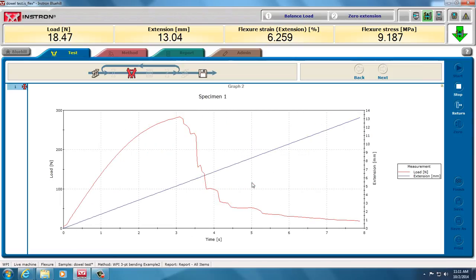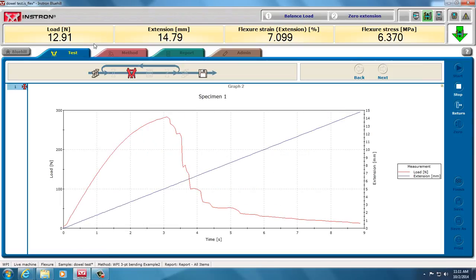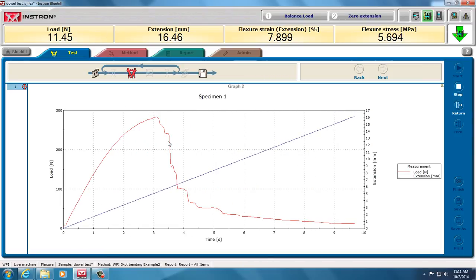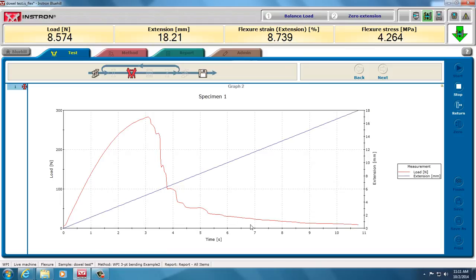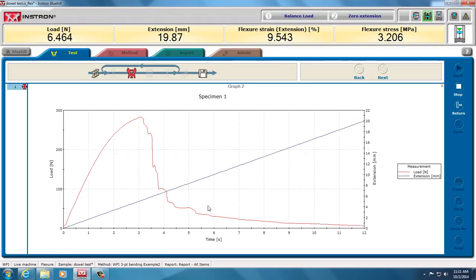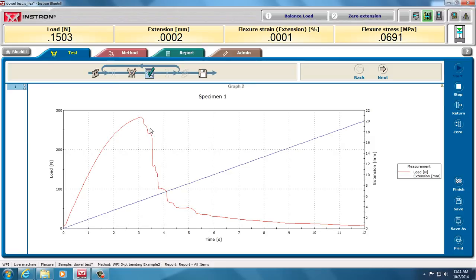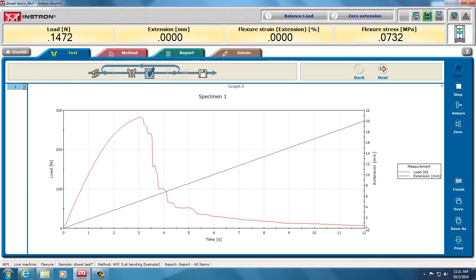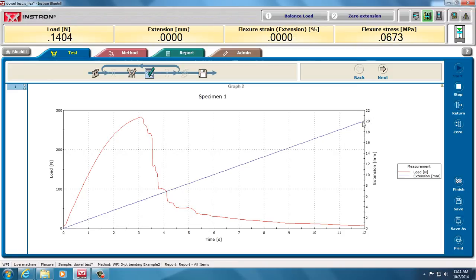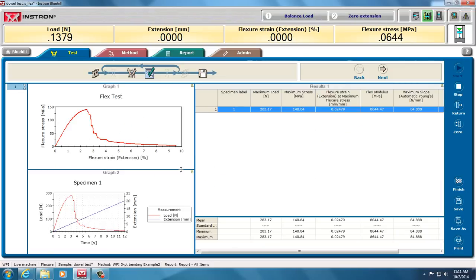And there it broke. Now you can see this is still going on and on because the rate of loading didn't occur fast enough for it to stop immediately when this first part of the braking happened. Eventually, it reaches 20 millimeters, which I said was the furthest I wanted to go. So that was my second end of test criteria. So here's my load and my displacement. I've had it. This is a circular cylinder. I've had it also calculate stress and strain for me.